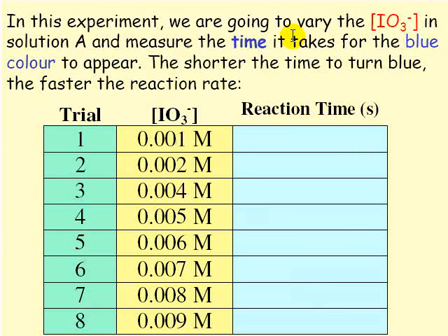So what we're going to do in this experiment is we're going to vary the concentration of IO3- in one of the test tubes. You can see the values here. And we're going to measure the time it takes for the blue color to appear. Again, realize that the shorter the time it takes to turn blue, the faster the reaction rate.